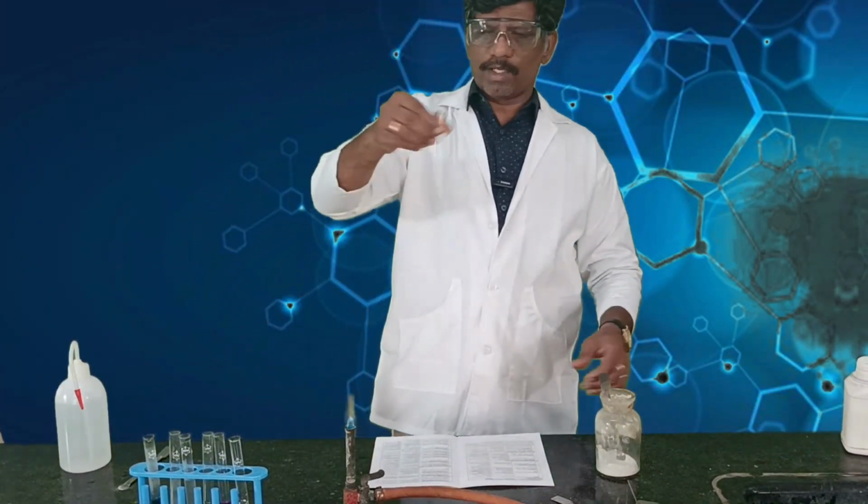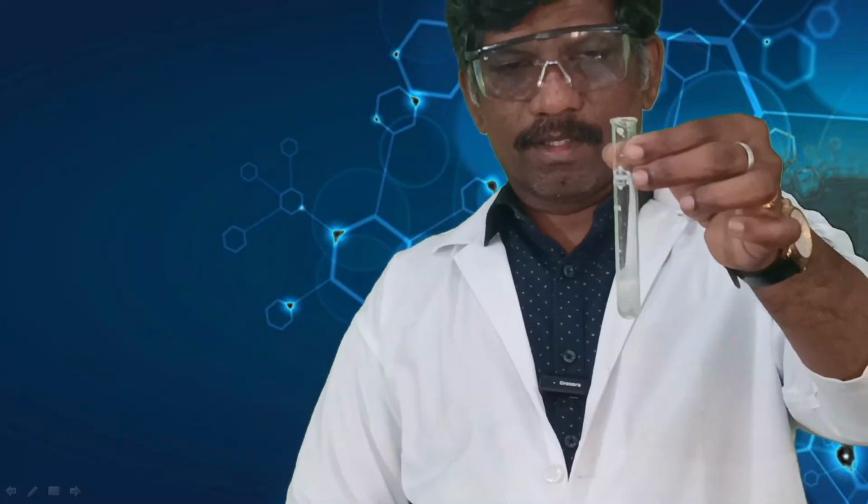Then take your substance, a little bit of the substance, and add it, and you will see the brisk effervescence.